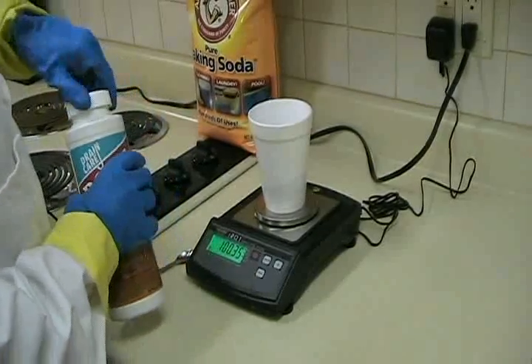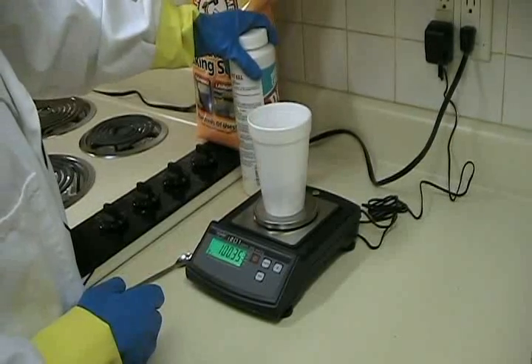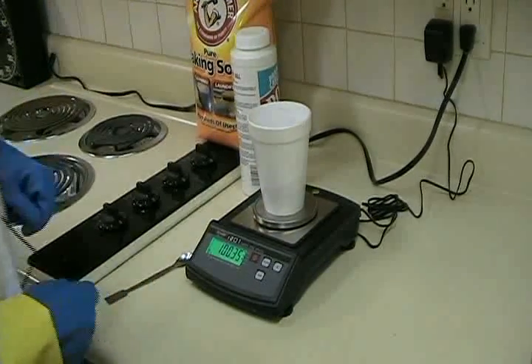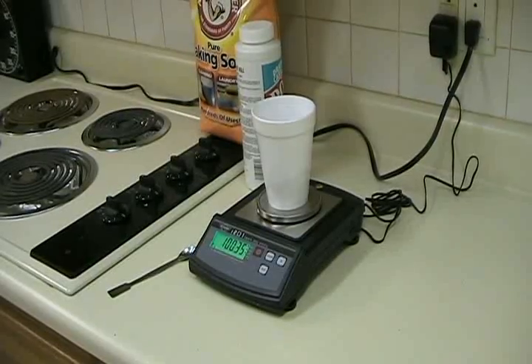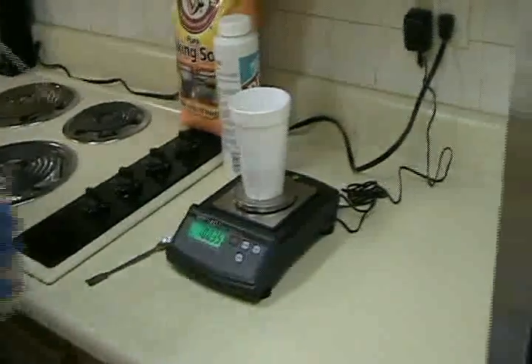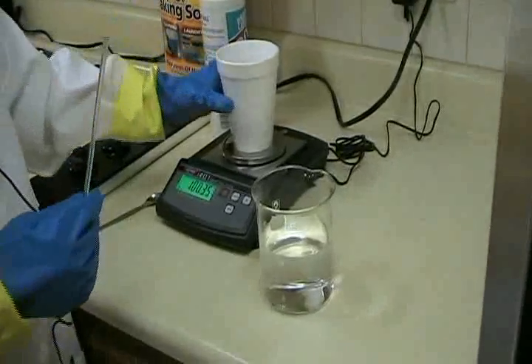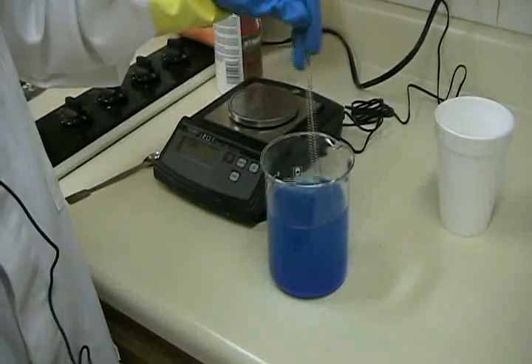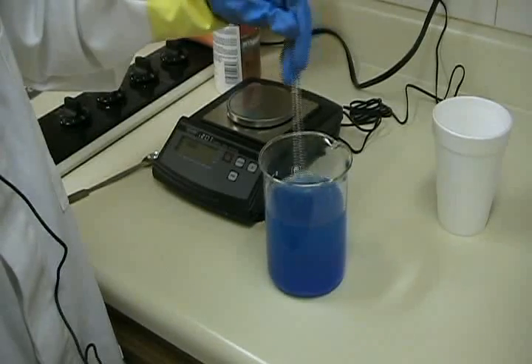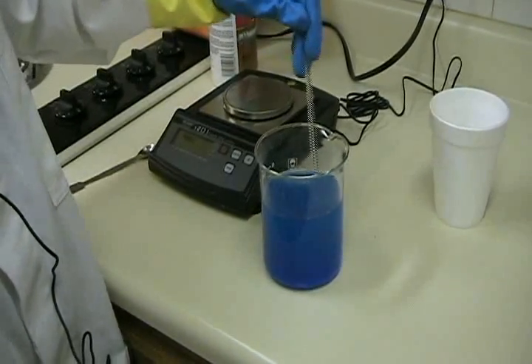I am now going to dissolve this 100.35 grams of copper sulfate in about 400 milliliters of water. Now that I've added the copper sulfate to the 400 milliliters of water, you can see it makes a beautiful blue solution, though it doesn't appear to have fully dissolved yet.